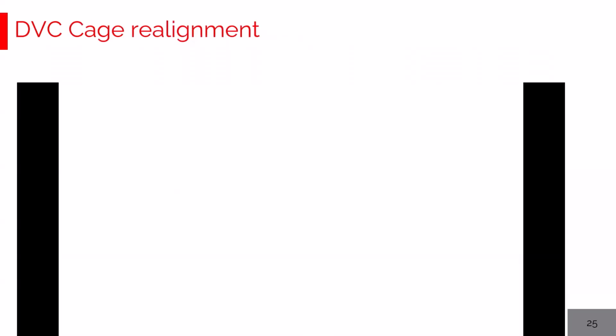By using DVC, especially in the past, and honestly, it's happening less and less at the current time, there was sometimes a misalignment between the reality and the software, which is obviously really important to fix. There is an advanced functionality called realignment that can be used in case of this misalignment situation. Let's have a look and then we discuss this feature.